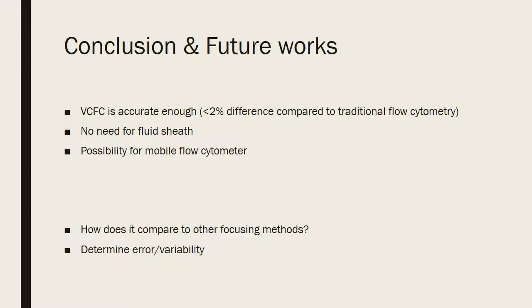Some considerations for future work include comparing VCFC's results to other focusing methods, since those also don't require a fluid sheath. How does it stack up in translational potential compared to those already in the market? Additionally, how stable is the system? I noticed that they did not include the variability of the system, which is important in not only delivering accurate results, but also a robust mobile system that can be taken out into the field.